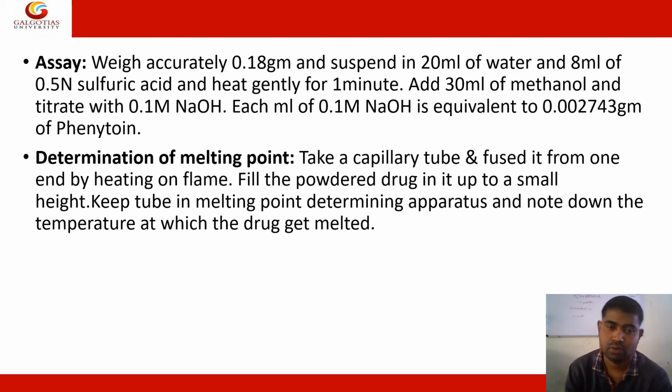So each ml of 0.1 molarity sodium hydroxide solution is equivalent to 0.002743 gram of phenytoin. So you can also use this for the calculation. And another pharmacopoeial standard is the determination of melting point. So you just have to take a capillary tube and fuse it from one side by heating on a spirit burner, fill the powdered drug in it up to a height, keep this tube in a melting point determination apparatus and note down the melting point.